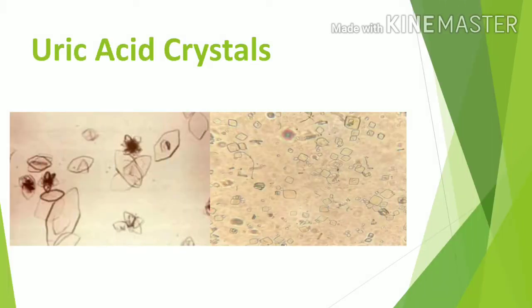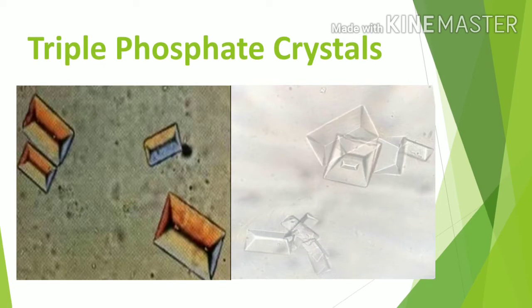This picture shows two types of Uric acid crystals under the Microscope. The first picture is the beginning stage of Uric acid crystals in rosette formation. The second picture shows numerous diamond shaped Uric acid crystals. Next, Struvite crystals or triple phosphate crystals under the Microscope.